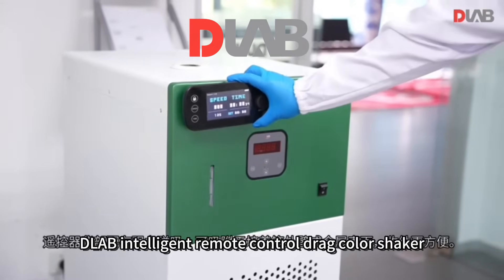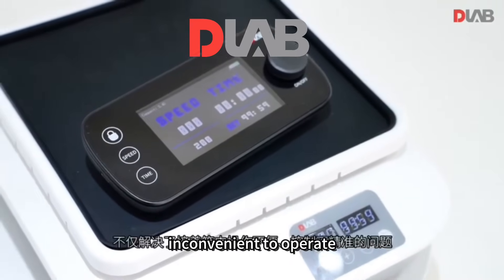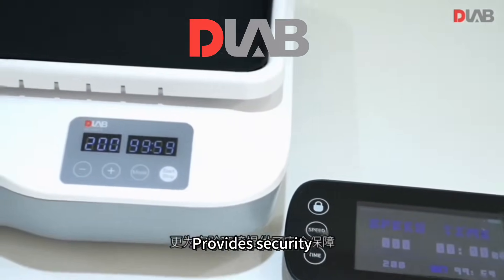The D-Lab intelligent remote control shaker not only solves the problem of inconvenient operation inside the incubator and the problem of inaccurate control, but also provides greater security for the experimental environment. Have a good day.